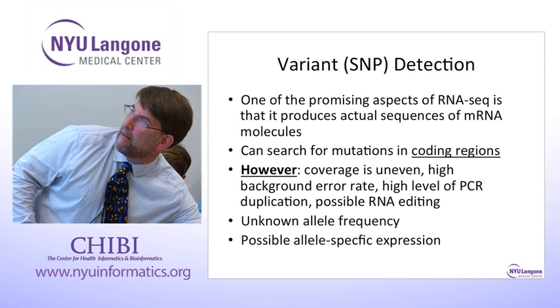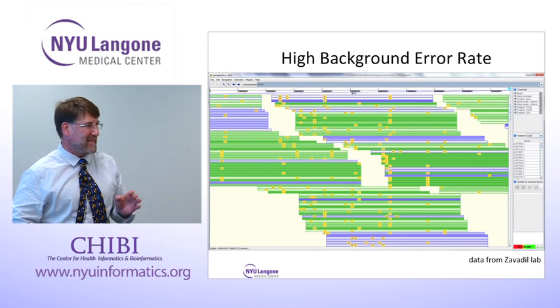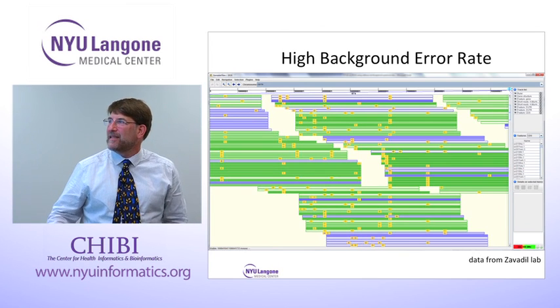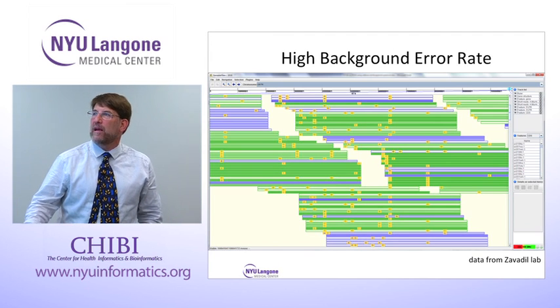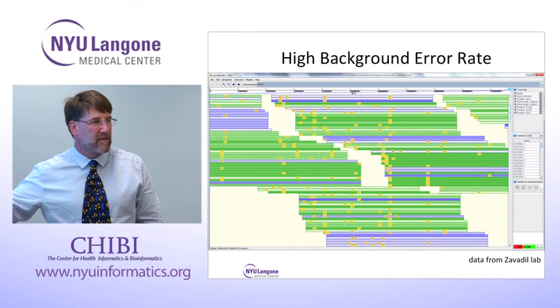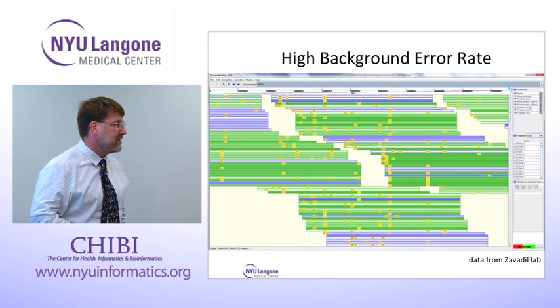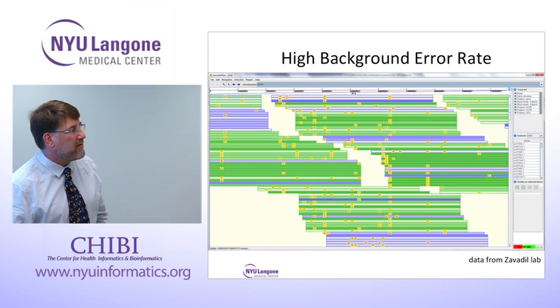OK. So, back. Here's an example of extreme bad data. I don't know why there's so many mutations in this data, and they're sort of all over the place. But it's probably not true that all of these variants are present in the original genome from which this DNA was transcribed. It would be really a nightmare to try and call SNPs from this data set, which he asked us to do. And we got hundreds of thousands of SNPs, and they didn't validate well at all.